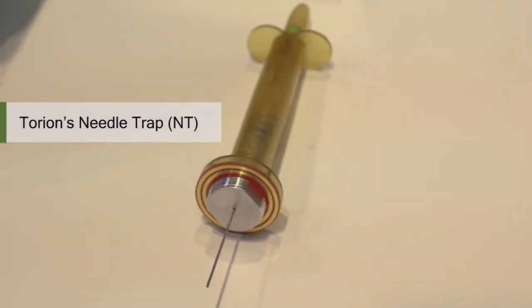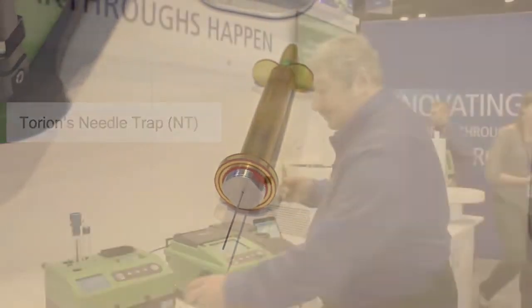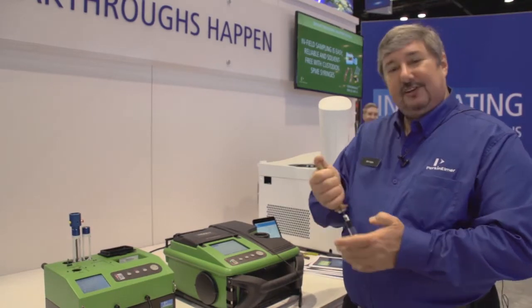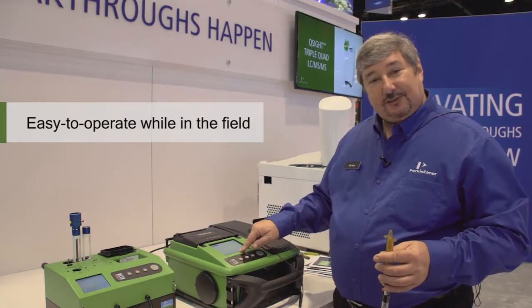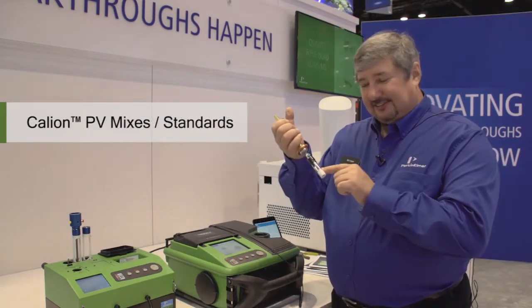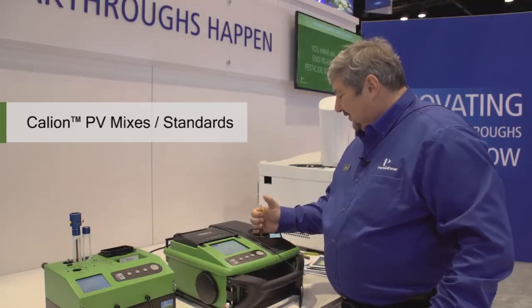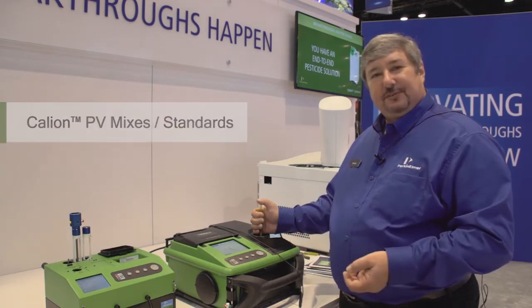The needle trap is a thermal desorption device — I can analyze air. While we're talking through this, I will actually run a sample so you can see how simple this is to operate. We have a start run button; I will press that, and this has a standard in it that I'm going to inject. So I make an injection like so, and then the run is going to proceed.